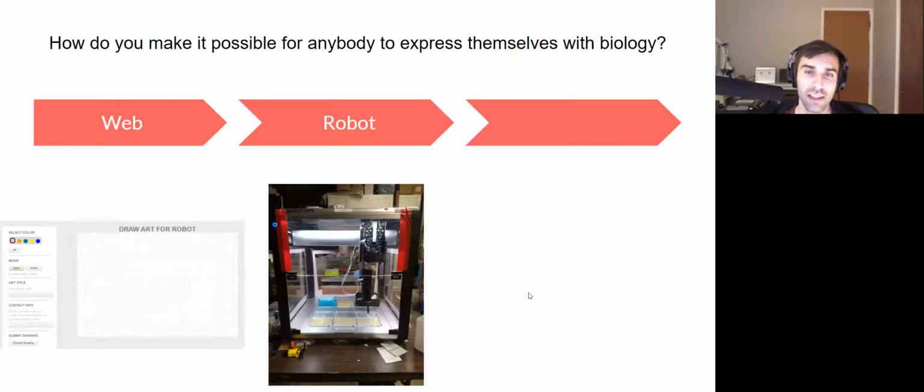It needs to be simple so that it's the sort of thing someone can jump in and learn on, but flexible because it has to do a couple of different things, as you can see here. And we don't want to limit it to only ever being able to do printing pixel robot art, right? Maybe we want to do different kinds of art, or as we'll talk about more in the future, any arbitrary lab protocol. So that's the challenge there.